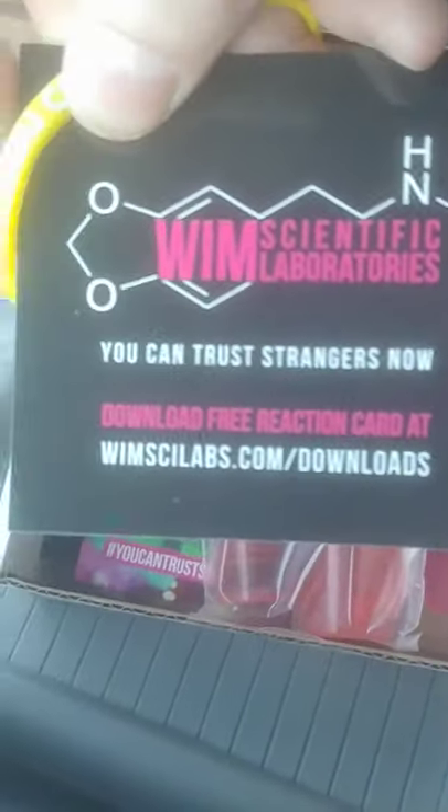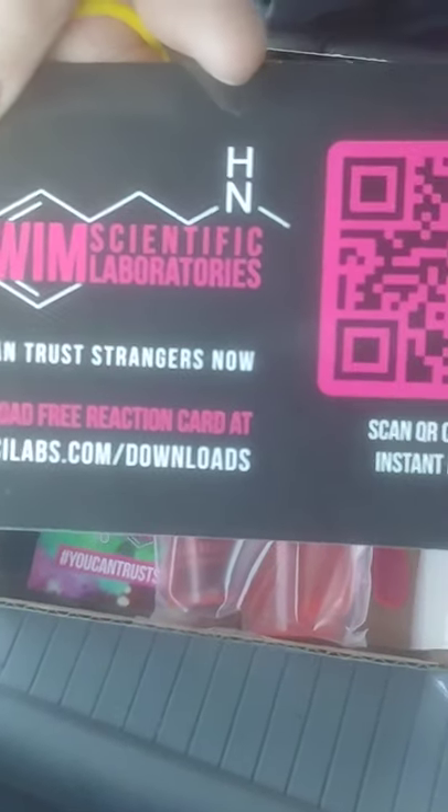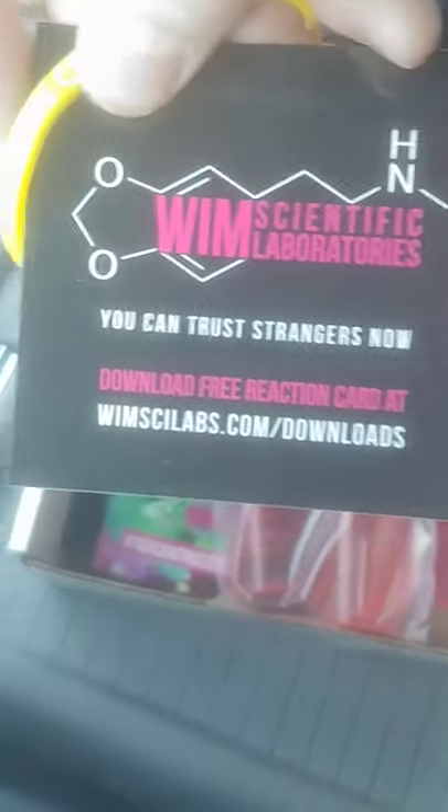It's from this spot right here. And right now, if you call them, they'll give you all three testers. It's like $22 after tax.